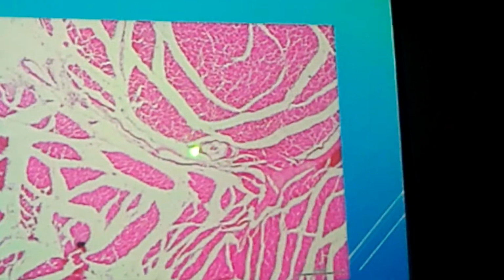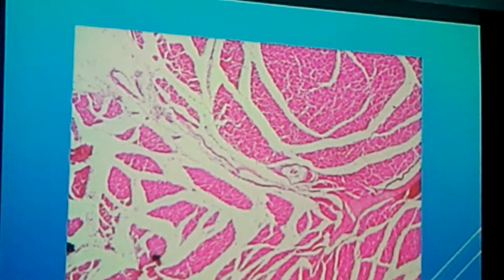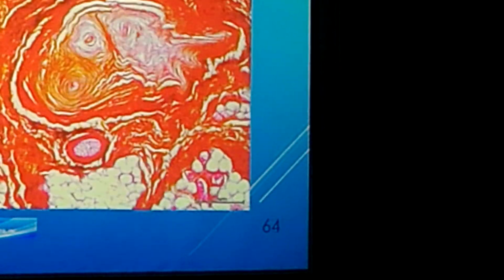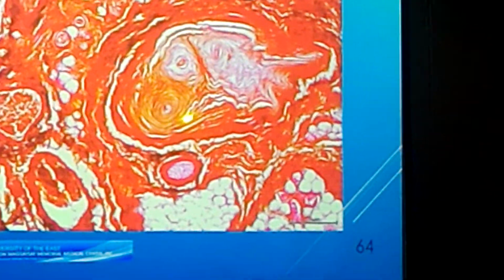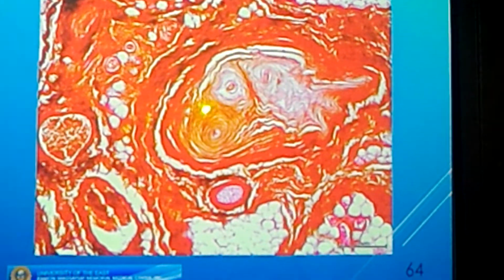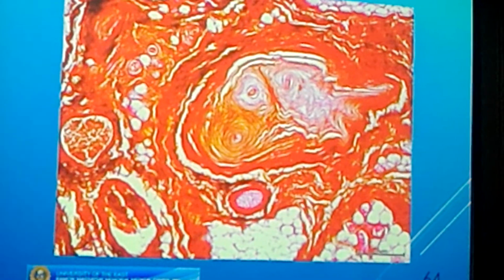Identify, give the function. Skeletal. Okay, so proprioception is okay, or position sense. Receptor. Proprioception. Classify. When identifying, point it out. When classifying, it is lamellated connective tissue.